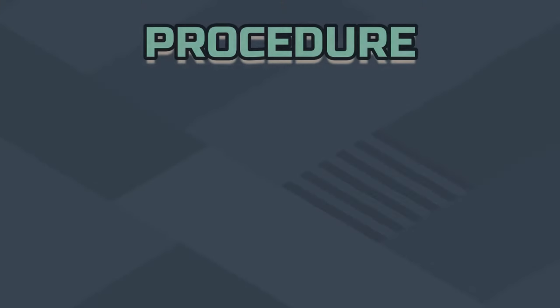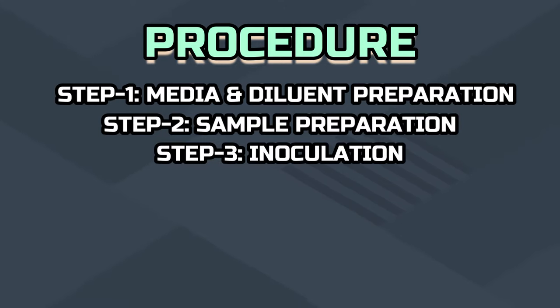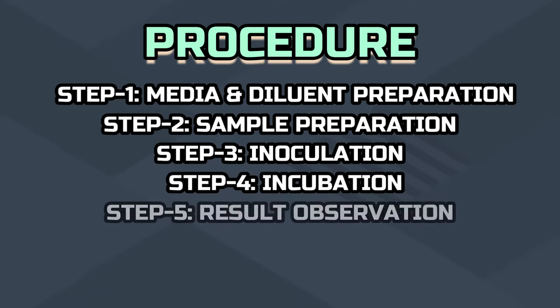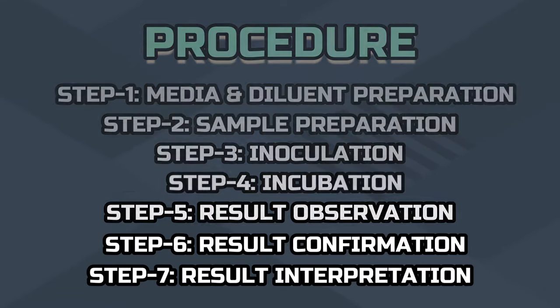To carry out the test, we need to follow some steps such as culture media and diluent preparation, sample preparation, inoculation, incubation, result observation, result confirmation, and result interpretation.